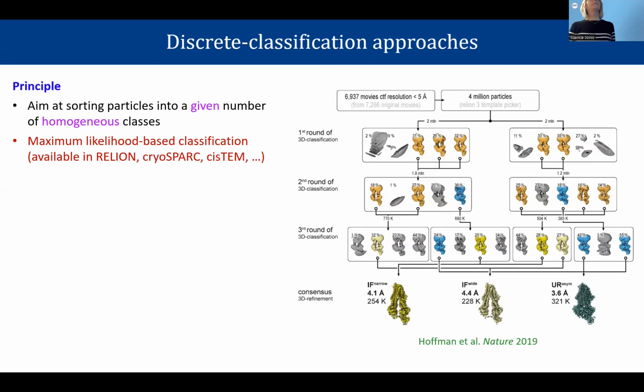But, for example, classical approaches are based on maximum likelihood classification, and how you do it is that you run once with n classes, and then you run with M classes, and then you compare the results at the end, and you see how many new shapes you obtained, because yes, you need to do it this way.